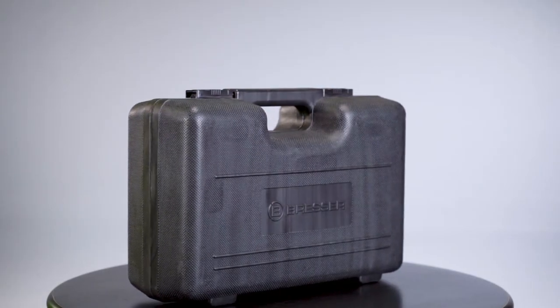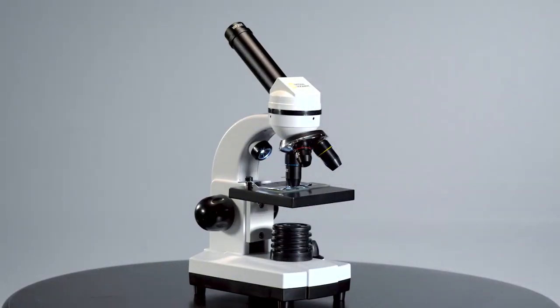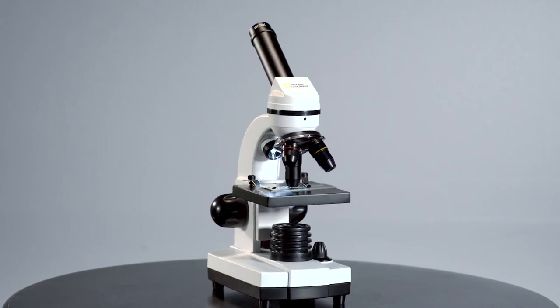The durable case keeps the National Geographic 40-1600x microscope ready to go at home or on the road.